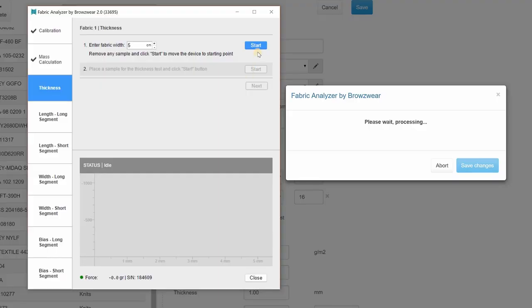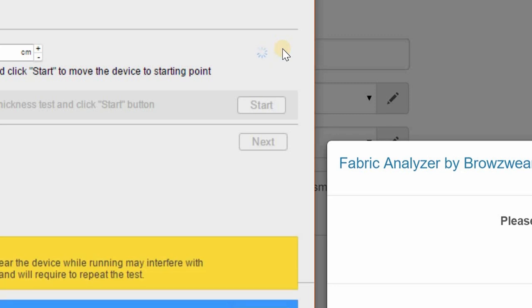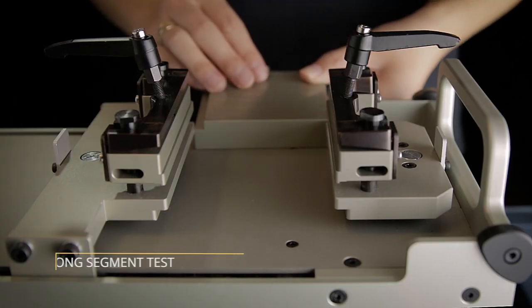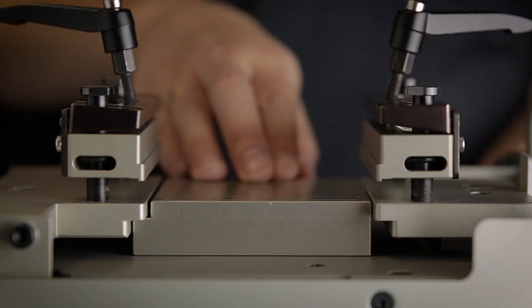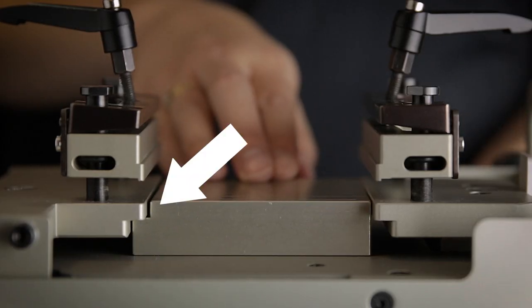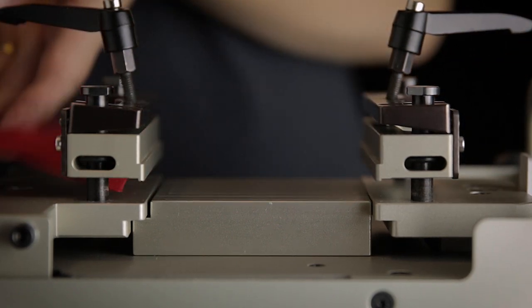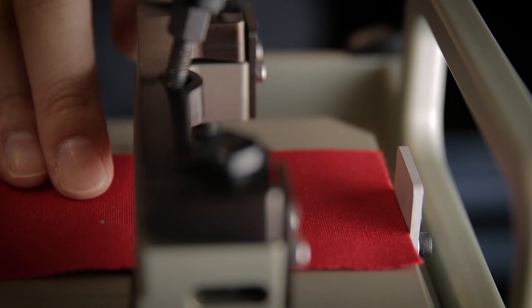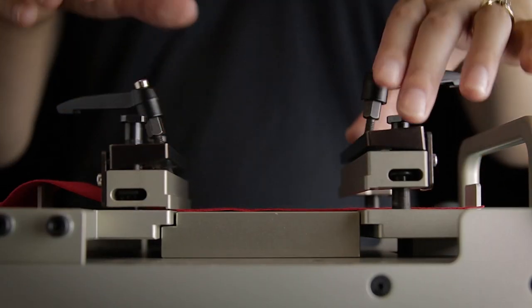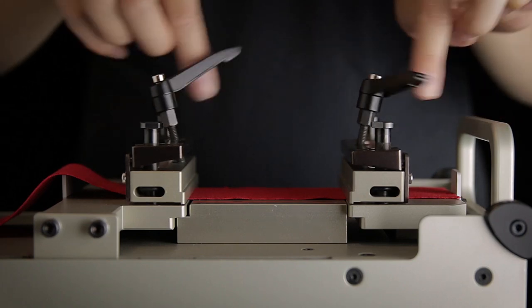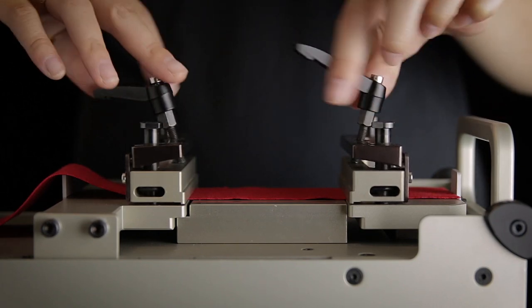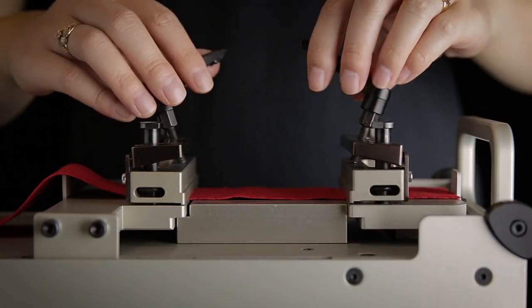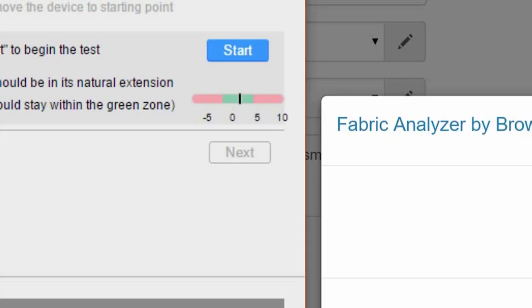Hit Start to begin the long segment test. Once the Start button turns blue, insert the large spacer into place between the two arms ensuring the groove is underneath the movable arm and not the fixed arm. Slide the sample fabric under the clamps face down making sure to align it between the long grooves on the spacer until it meets the stopper on the fixed arm. Lower the clamp and wind the tightening knob until the sample fabric is secure. To ensure the correct amount of force is applied, check the force indicator range on your computer screen. Adjust the clamps or fabric position until the force is reading within the green zone.